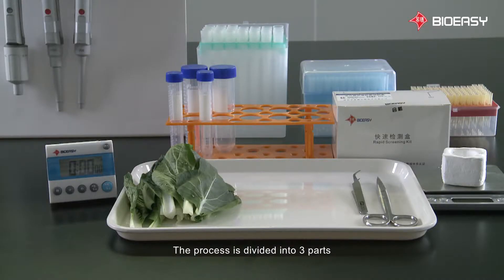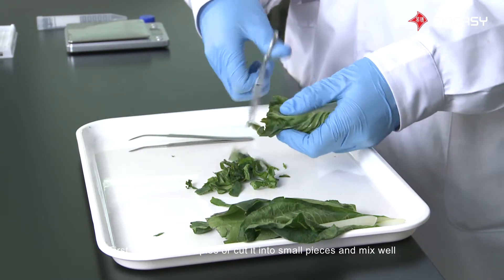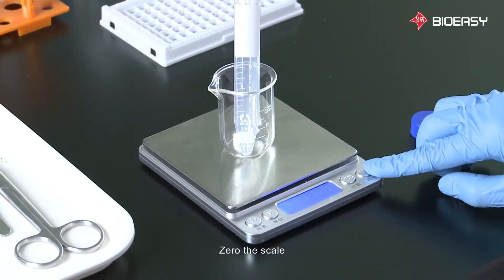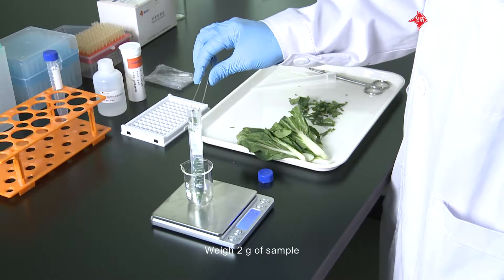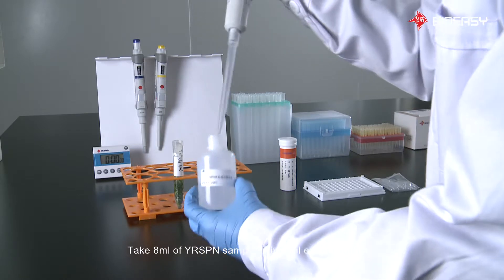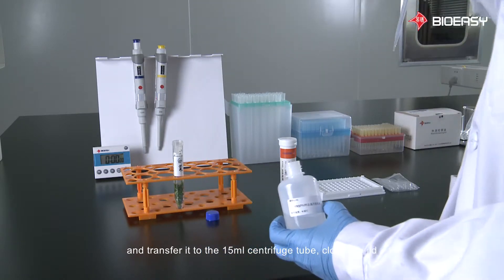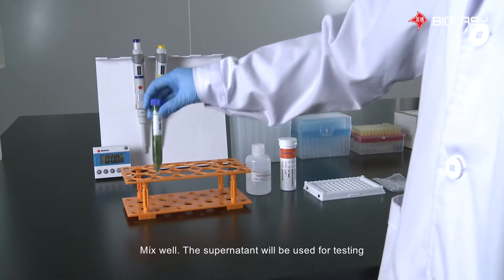The process is divided into three parts: sample preparation, sample detection, and results interpretation. First, mash the samples or cut them into small pieces and mix well. Zero the scale and weigh 2 grams of sample. Take 8 milliliters of YR-SPN Sample Universal Extract Solution and transfer it to the 15-milliliter centrifuge tube. Close the lid, mix well. The supernatant will be used for testing.